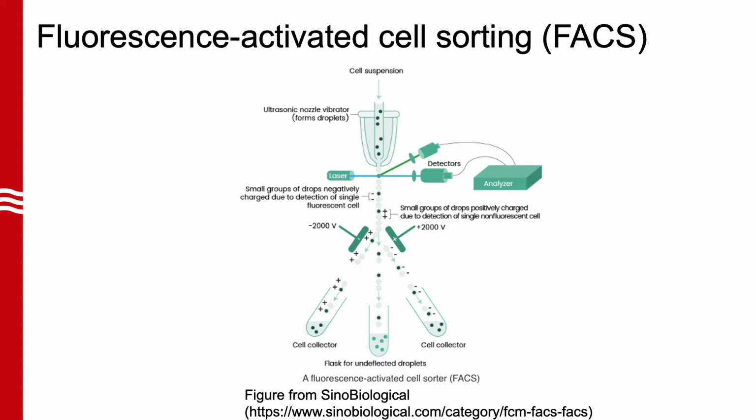In the case of this study, soluble wild-type ACE2 was incubated with cells expressing the wild-type spike protein of SARS-CoV-2 or the library of the deep mutagenesis scan. This is the scan that mutates each individual amino acid one at a time. So that is what was the cells that were suspended in these droplets. And then they were sorted based on their binding ability and the characteristics of that binding.